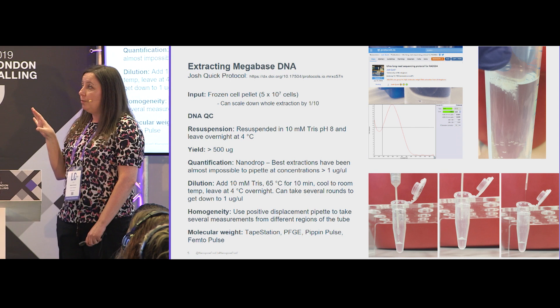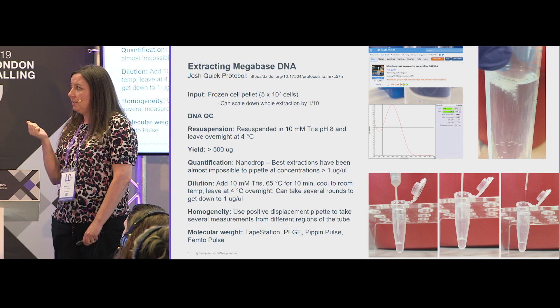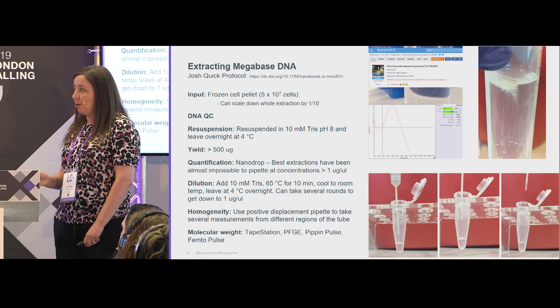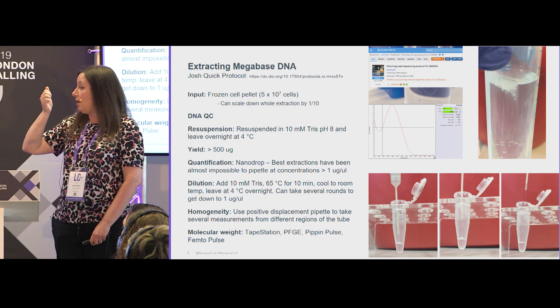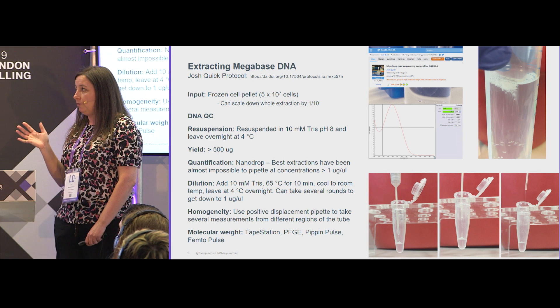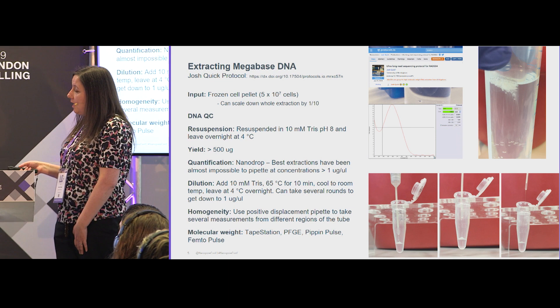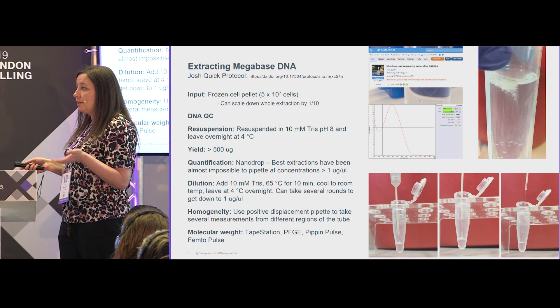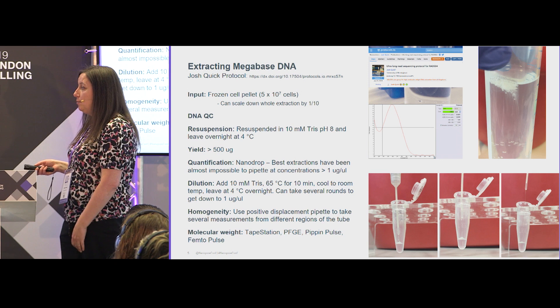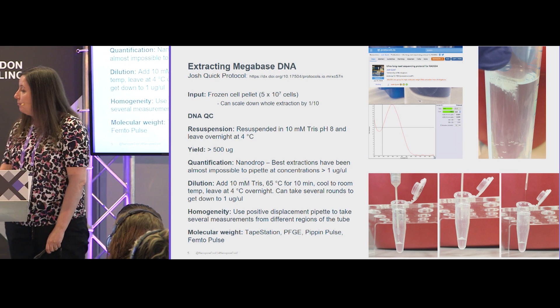This protocol gives a very high yield of DNA — over 500 micrograms when we take 5×10^7 cells. The concentration is extremely high, often up to 5 micrograms per microlitre, and this is almost physically impossible to work with. Pipetting can be a massive battle taking over 10 minutes, and the DNA is sometimes just sucked straight back into the matrix. It's very important to dilute down to about 1 microgram per microlitre where it becomes workable, though it remains extremely sticky. You have to very slowly withdraw the DNA, and you can see it has this massive stretch — but if you do this slowly enough, you will eventually get a good amount out.